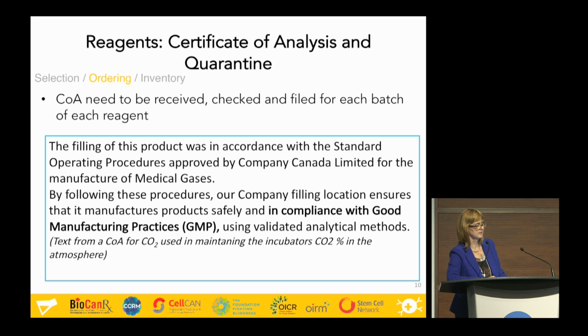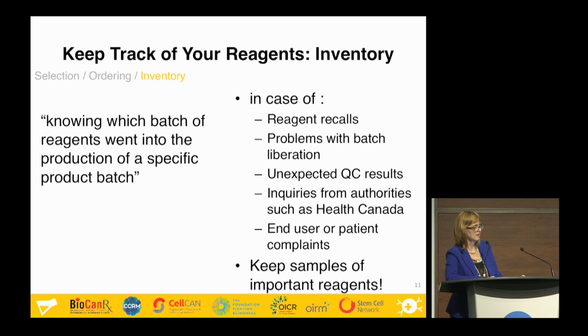If, as I discussed previously, you have tests to be done before you can release your reagent, you need to put your received reagents in quarantine, which is a secure storage that prevents anyone from using the product in the production process before you have cleared it for use. Once all the tests have come back and they are okay, then you can release your product and add it to your inventory.